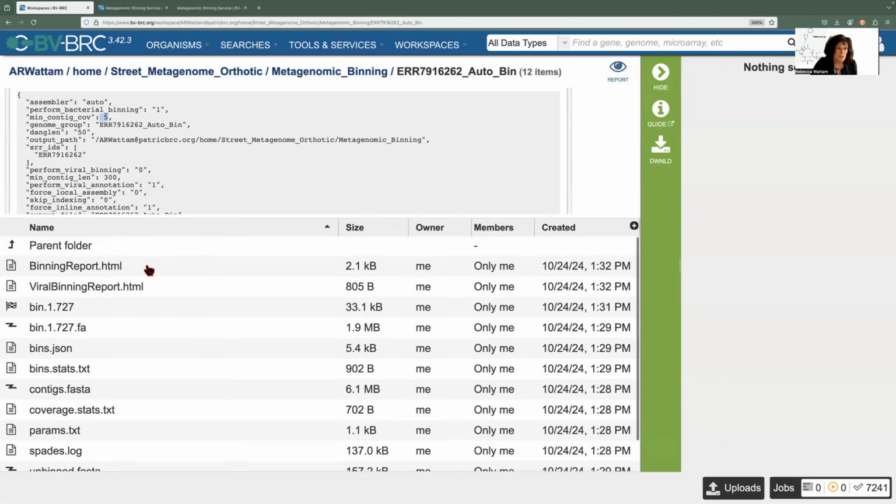So we checked on this and checked on this. We'll go over this, the bin with the checkered flag, meaning the job completed successfully. We'll do this very briefly, but there'll be deeper dives on the genome report associated with this in a later video, so I don't want to do it now. And this is the contigs associated with this bin.